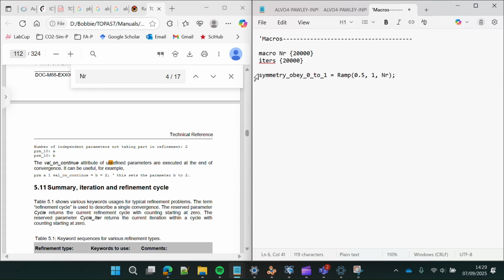So this is telling the charge flipping procedures to obey the symmetry on a ramp. And we're going to set up all of the ramps so that they're all ramping from 20,000. And then they slowly all converge to the final solution. And hopefully that final solution should be what you want if you set up the other things correctly. So let's get rid of this for now.